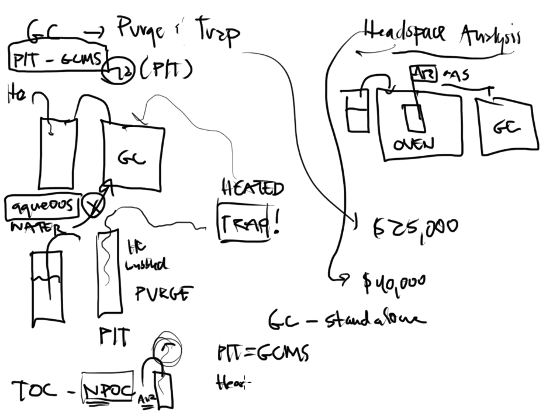And then we also have a Headspace unit, which is attached to another GC in our lab that we don't really modify or change. That's kind of its dedicated purpose, which is why we use that GC, and it has a different detector on it. So we have a couple of different options in our laboratory, and you'll get to use every one of them. But that is the purpose of a purge and trap, and that's the purpose of a Headspace analysis.